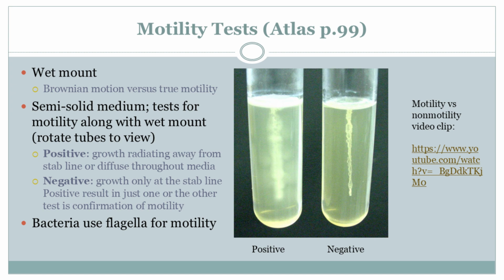In a way, yeah. And to introduce our bacteria to this Jell-O-like medium, we use what's called a stab line. We take a sterile needle, dip it in the bacteria, and stab it straight down into the medium. A stab line. Sounds kind of violent. It's not as bad as it sounds. We're just making a starting line for our bacteria. And then we let them grow for a bit and see what happens.